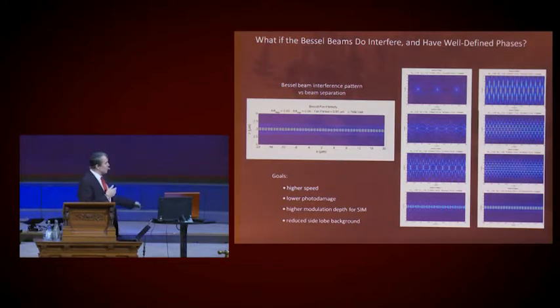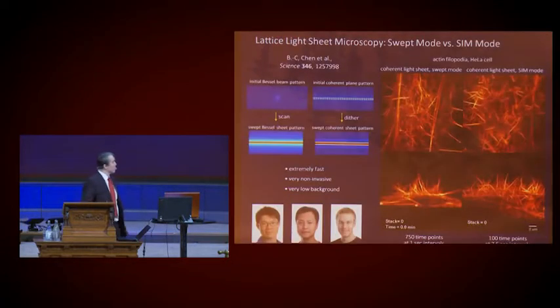As it turns out, these magic periods are related to a theory about optical lattices that I was trying to pitch and work on before we dropped it in order to do PALM. And so I dusted off my old theory and then applied that to light sheet microscopy, and that's what we now call lattice light sheet microscopy.